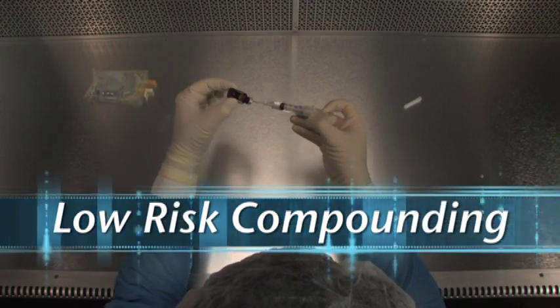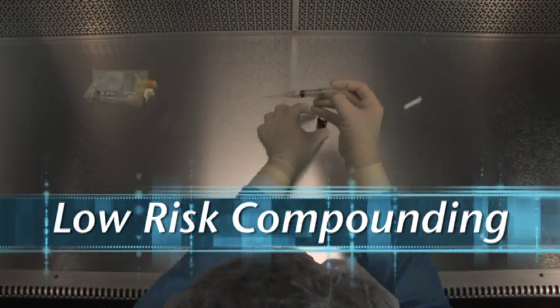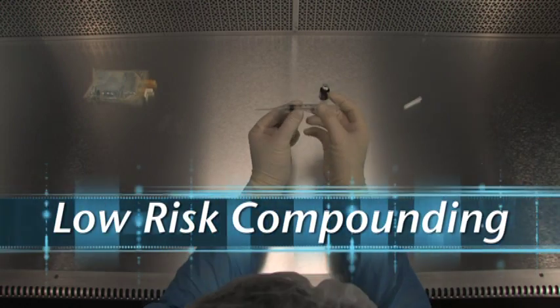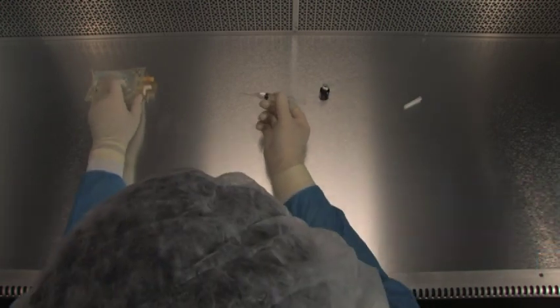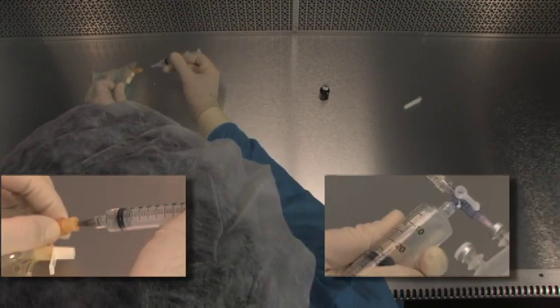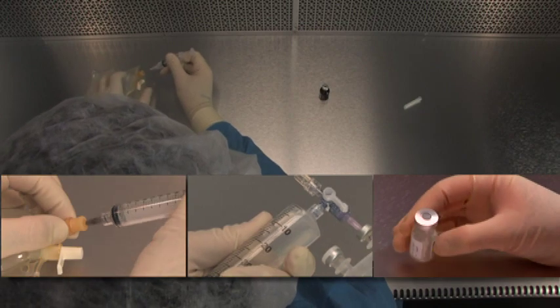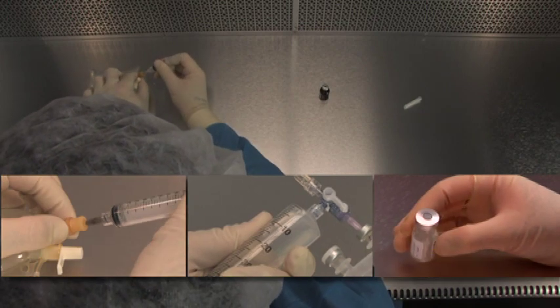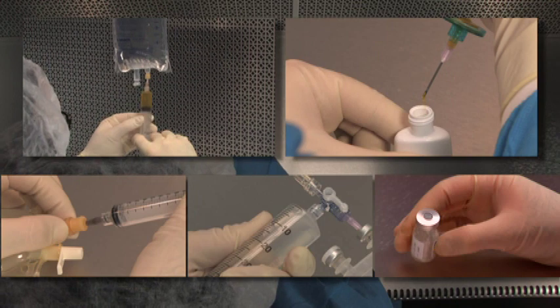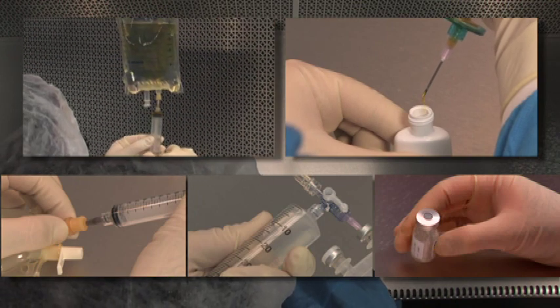Low-risk CSPs are compounded with aseptic manipulations entirely within ISO Class 5 or better air quality, using only sterile ingredients, products, components, and devices. To prepare the low-risk CSP, compounding involves only transfer, measuring, and mixing manipulations using not more than 3 commercially manufactured packages or sterile products, and not more than 2 entries into any one sterile container or package.